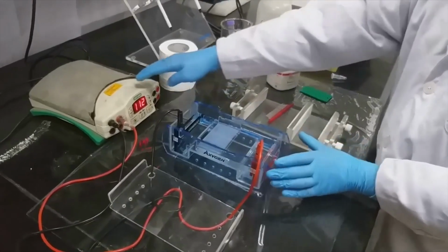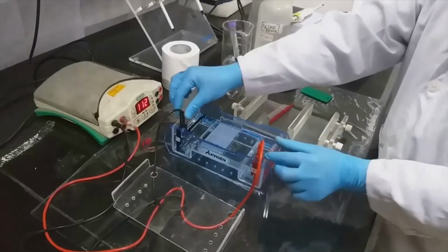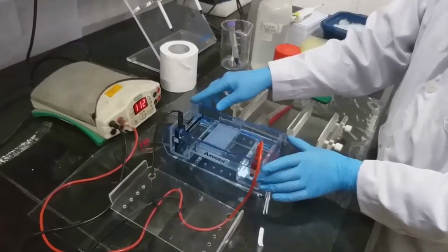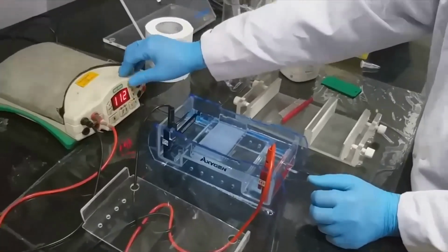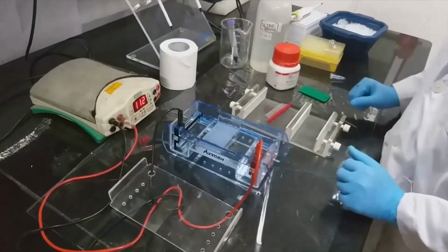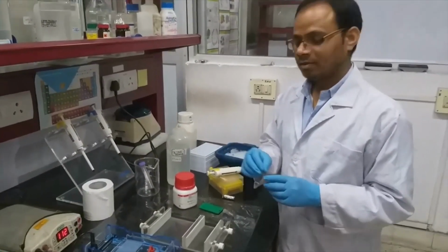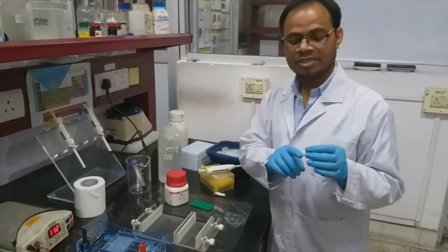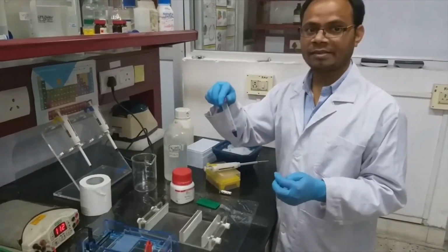This is the power pack and this is the electrophoretic apparatus. This is the negative electrode and this is the positive electrode. We can change the voltage from here. For loading the sample, we have to mix the PCR reaction mixture with 5x loading dye.